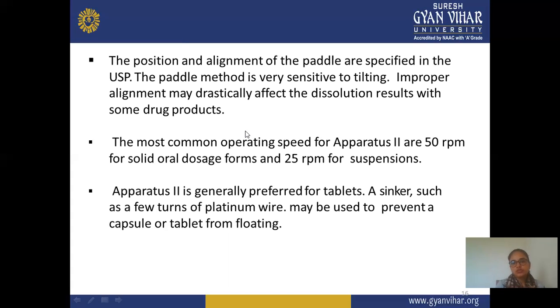Next, apparatus 2 is generally preferred over the basket, and a sinker such as a few turns of platinum wire may be used to prevent a capsule or tablet from floating. Majorly this type 2 apparatus is used for dissolution because it gives good results. The platinum wire keeps the tablet stable and protects the tablet or capsule from floating, and it prevents turbulence from floating.